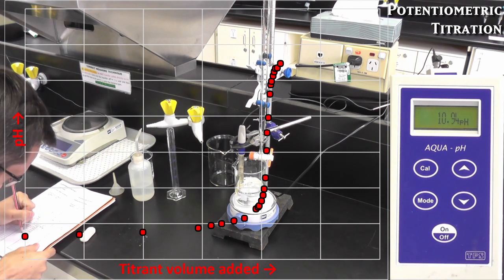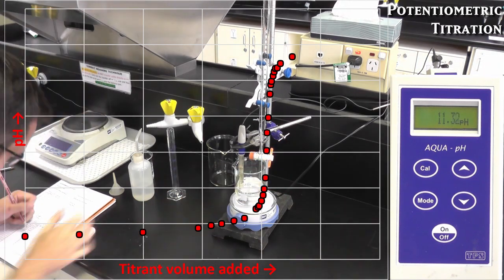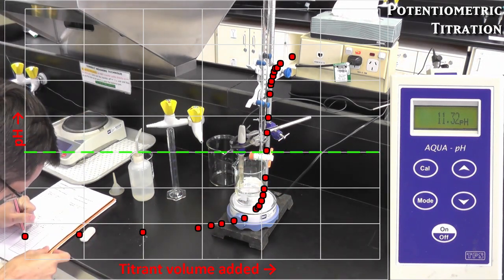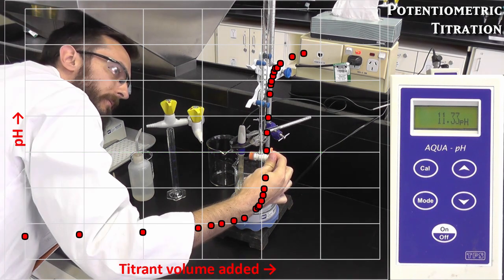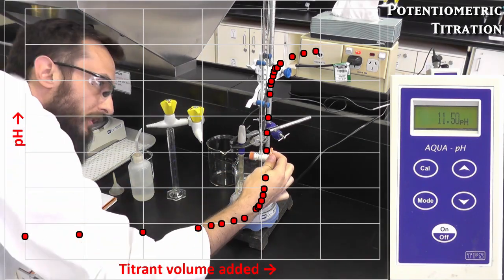When finding the equivalence point, do not use the data point collected closest to the center. Instead, measure to the center of the vertical portion of the plot, rule a horizontal line, and read off the corresponding pH value from the y-axis.